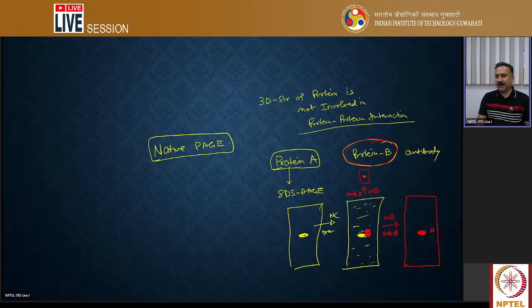If I get the band at the same position, then it shows that these two proteins are interacting with each other. So Shrutika, is it clear now?